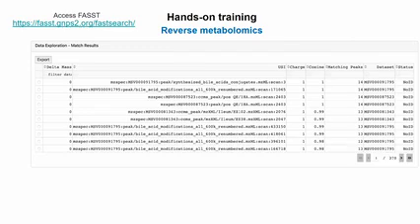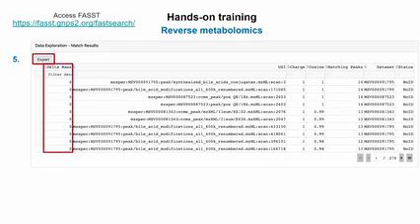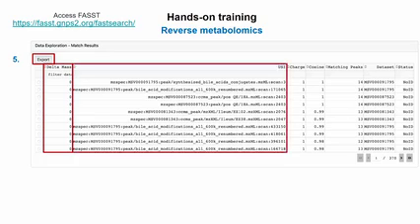When you click search, you can scroll down and you will see a similar screen to what I'm showing at the moment. This is what you would need to export, but beforehand, you need to know there is different information. Whatever you are exporting here, you need to check that the delta mass, usually it should be 0, and this is the USI that is matched when you do the fast search.